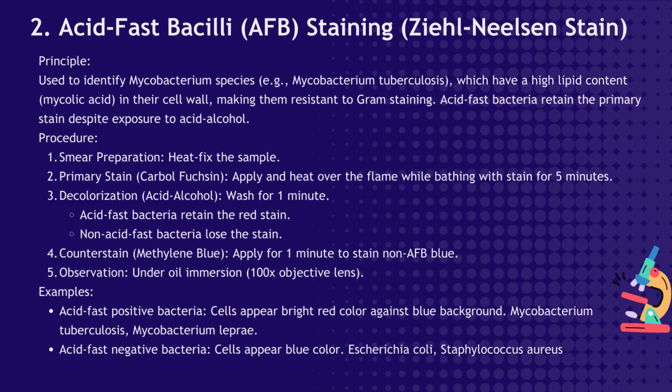Non-acid-fast bacteria lose the stain. Counterstain, methylene blue. Apply for 1 minute to stain non-AFB blue. Observation: under oil immersion, 100x objective lens.